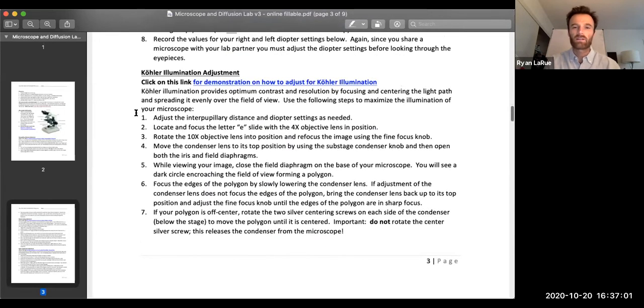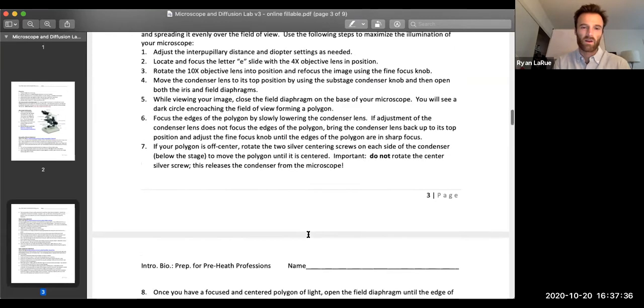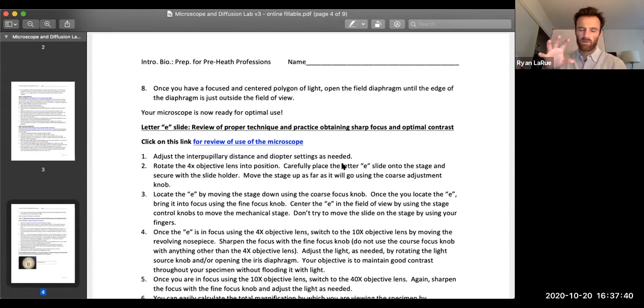The next is illumination adjustment. Having your illumination properly accounted for on your microscope will allow for the most clarity, the most contrast when you're viewing cells. There are step-by-step process on how to do that as well as a video. Having that contrast between the image and the light source will allow your cell to be as clear as possible or whatever you're looking at.